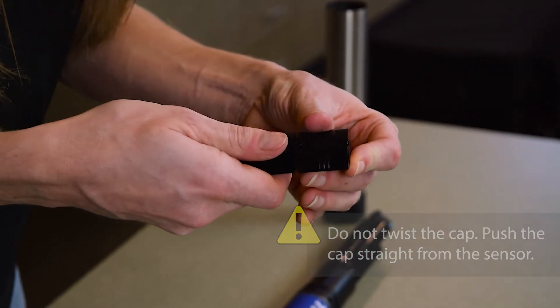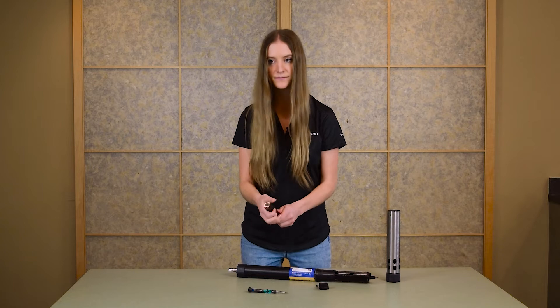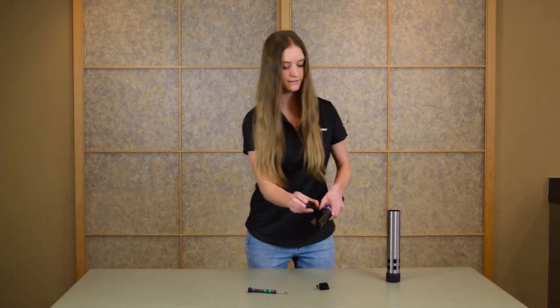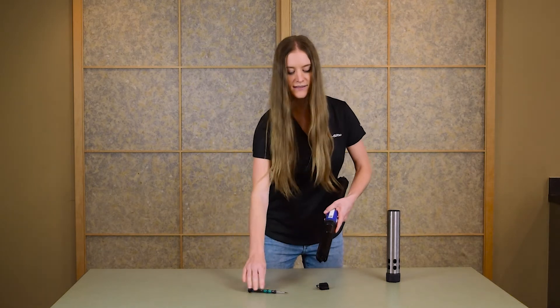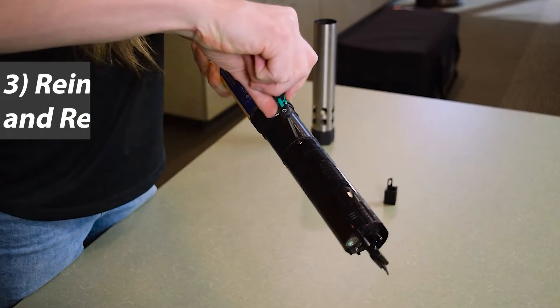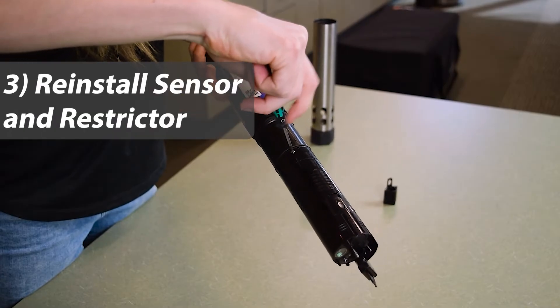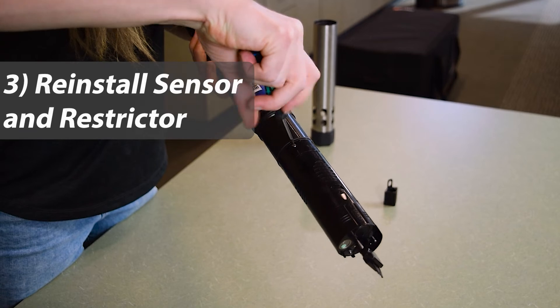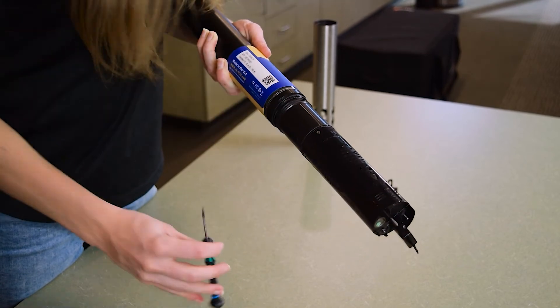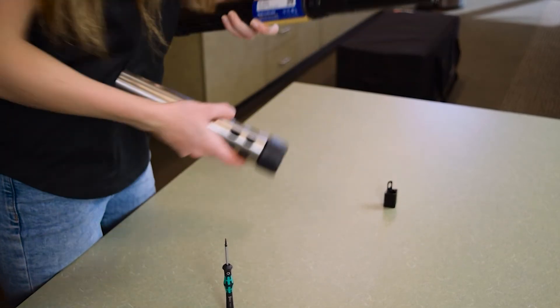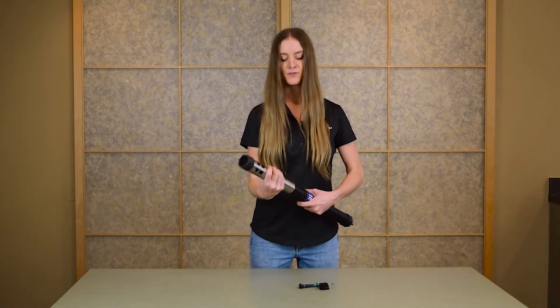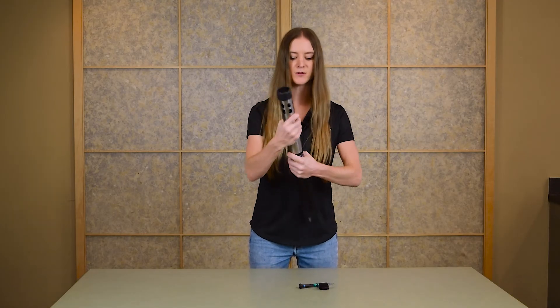Then you're ready to slide the new cap back onto the sensor. Install the sensor back in the instrument and tighten the sensor set screw. Reinstall the restrictor and you're ready to deploy it in the field.